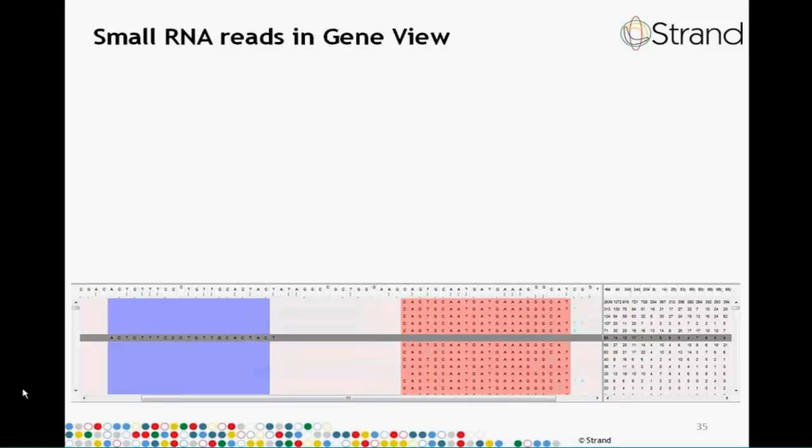Here, the left-hand side shows all the distinct read sequences. It also shows in blue and red the locations of the active regions. The sequence of the genome and the dot parenthesis notation are there as column headers. And on the right-hand side, you can see the count of the read in each one of the samples.